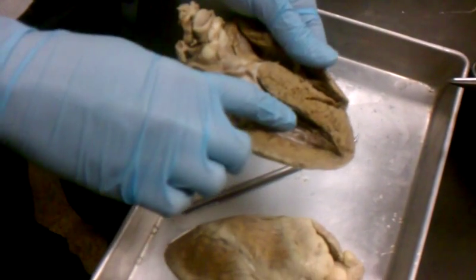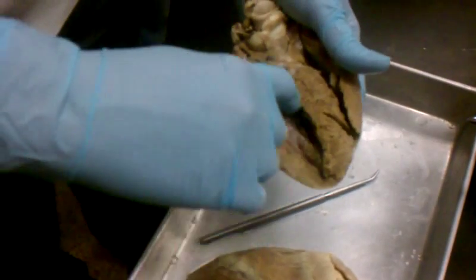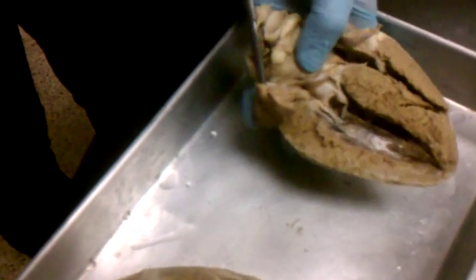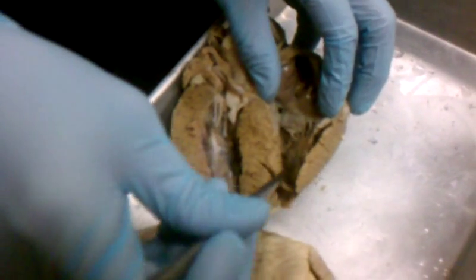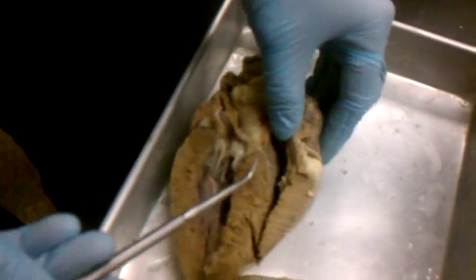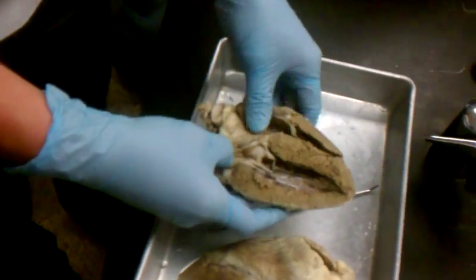So which side is this? Left atrium. Or, I'm sorry, left ventricle. This is the left ventricle. And then this in here, what's that? Okay, left atrium. So then this is the right ventricle. And all this up here? Right atrium. Everyone see that? Okay. So those are the ventricles and the atrium.